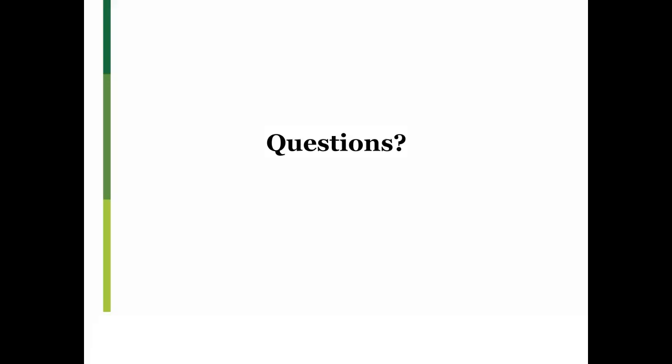I think one thing you lose when you dissociate tumors is all the morphological information that you would have on a tumor that's been sectioned. So in some respects, I think it could be useful. In other respects, you lose some information.